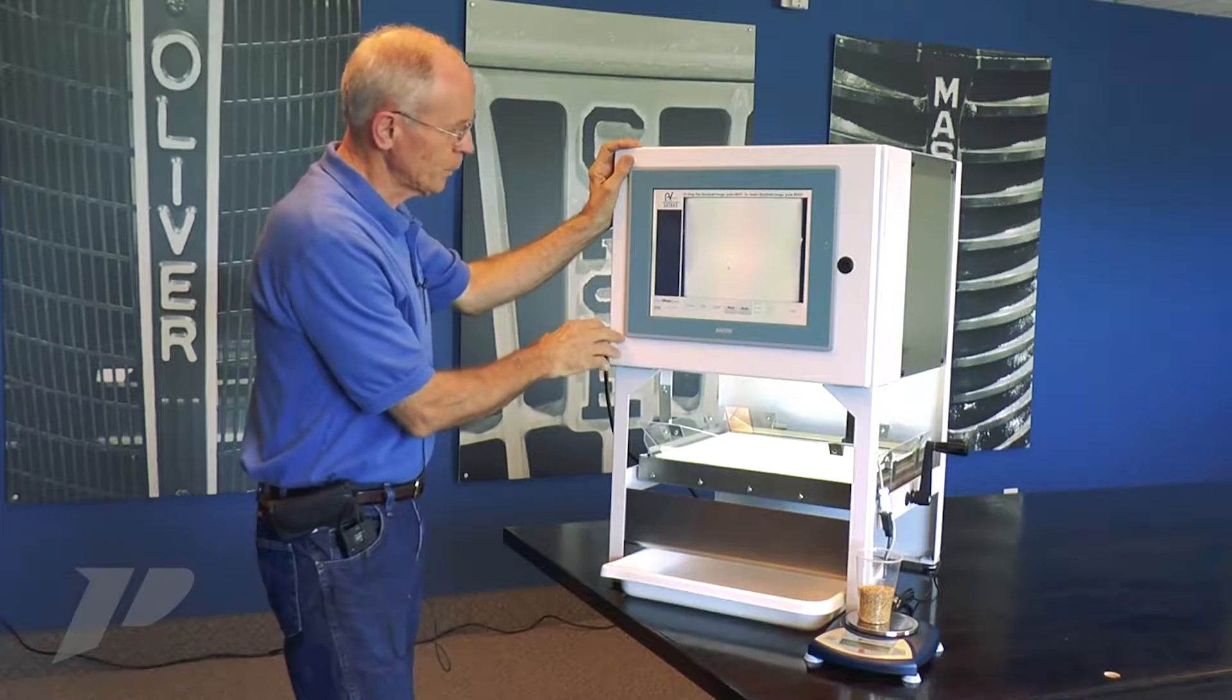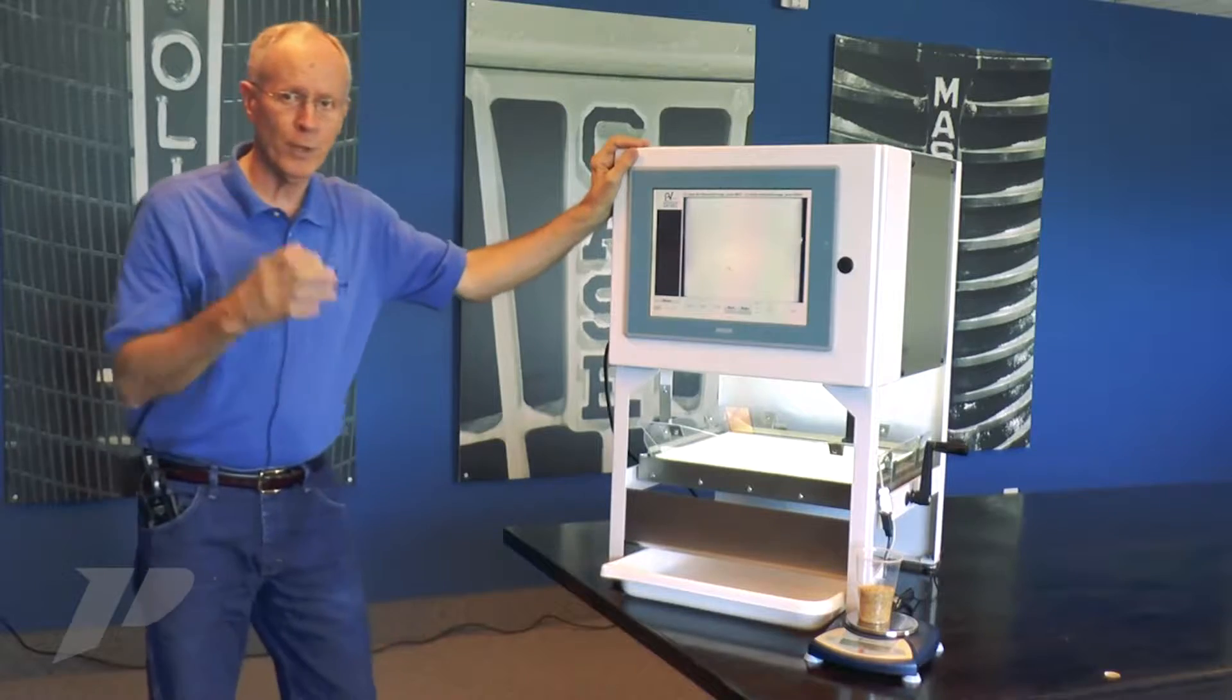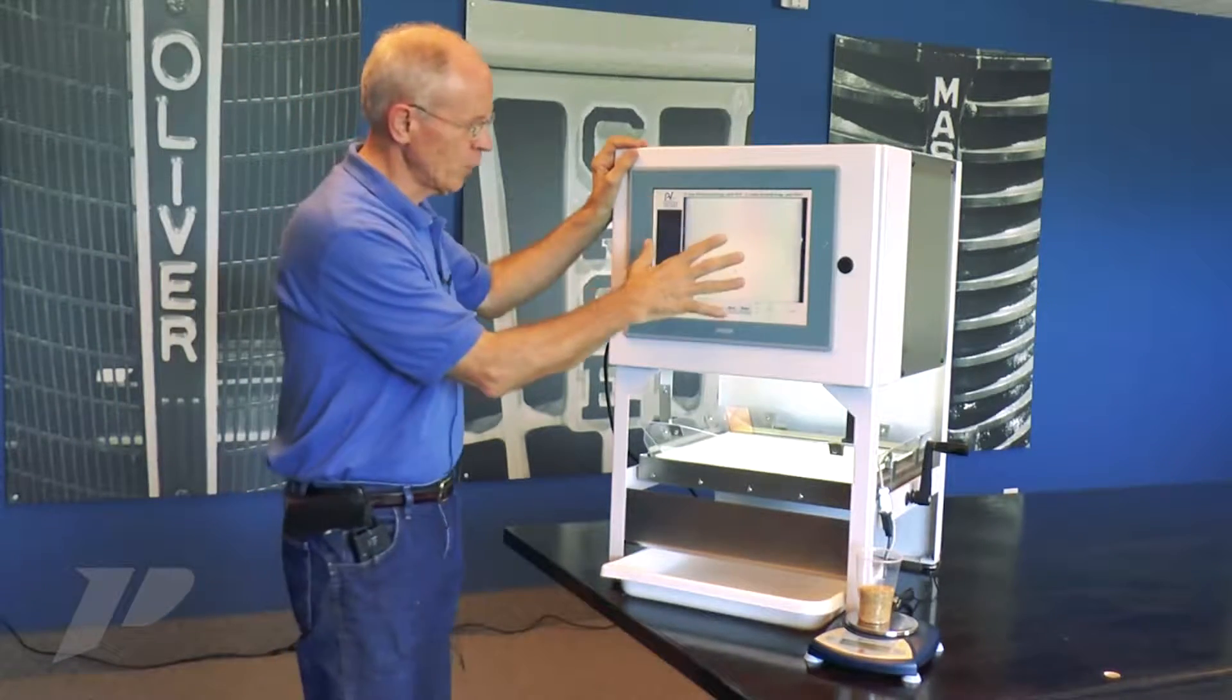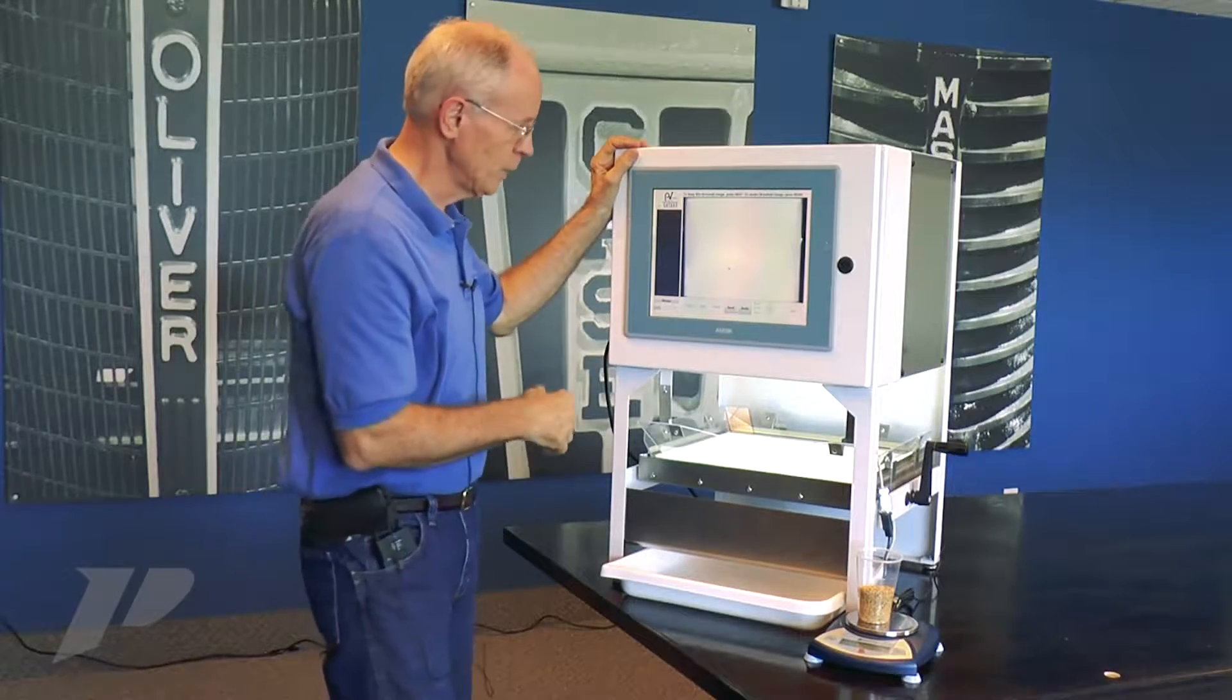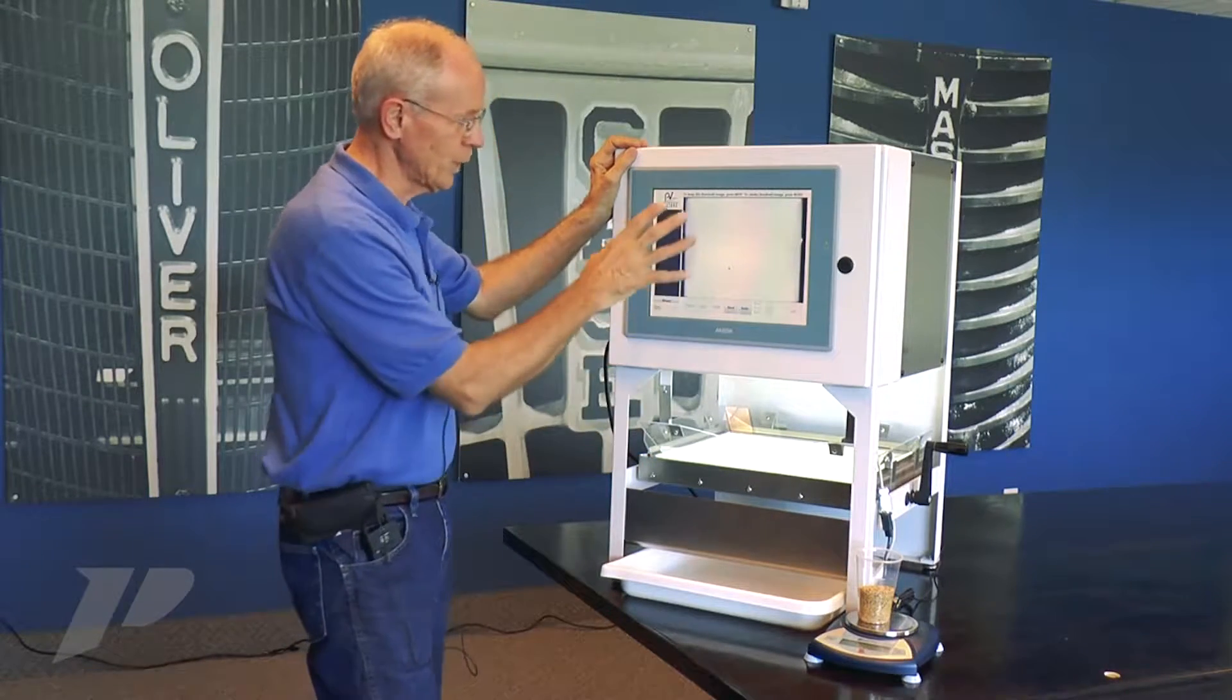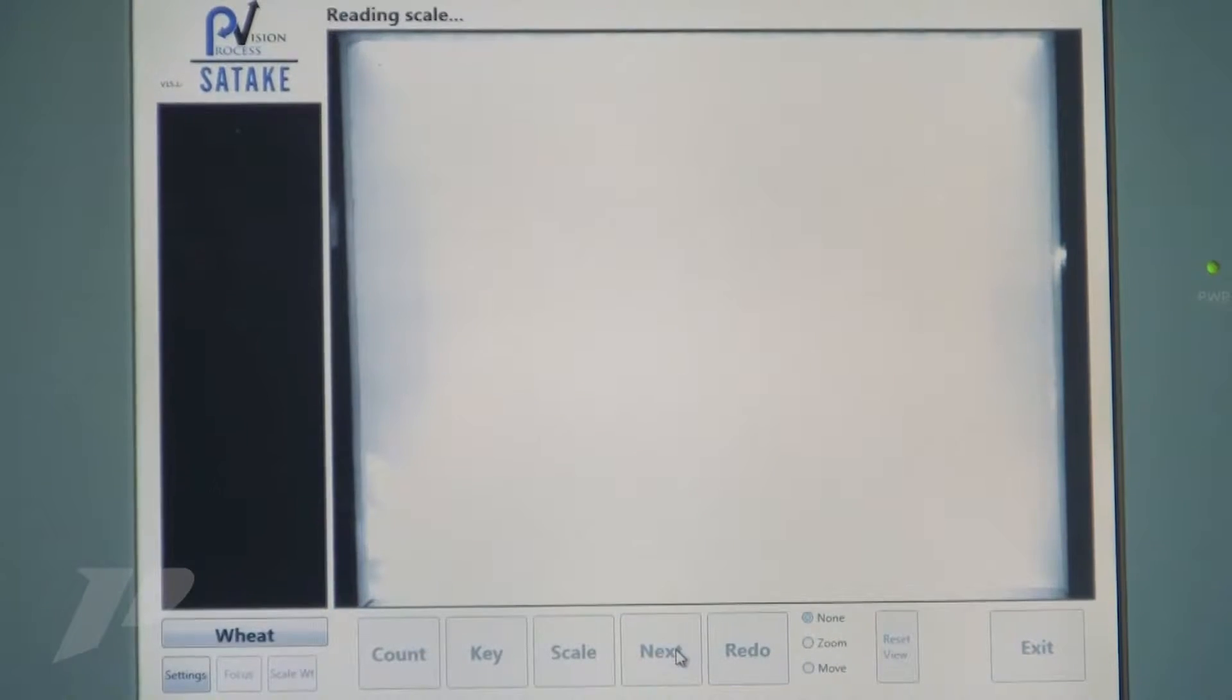We're getting a threshold image. We have a good clean threshold image. In vision, what we want to do is compare nothing to something. Nothing is what we have without the product. Something is what we take the picture with the product. We're going to look at the difference between those two, so we need to have a good background image for that. That's what we have here. I'll click next to accept that background image.